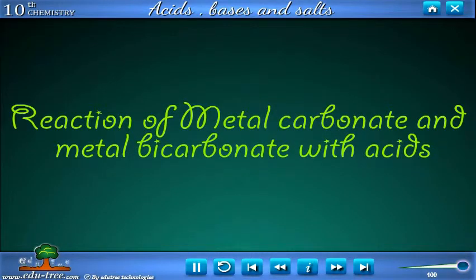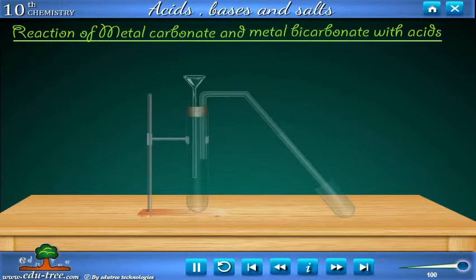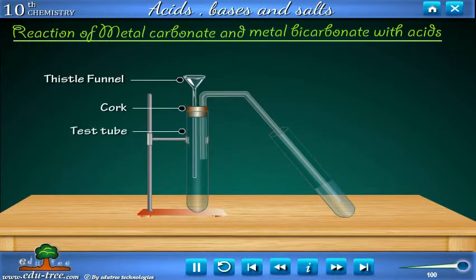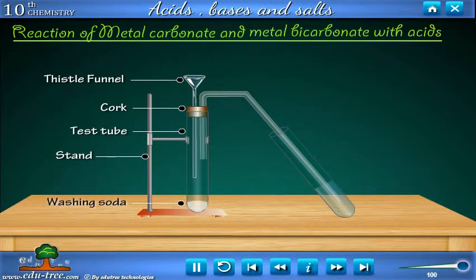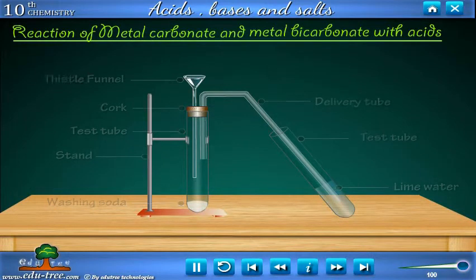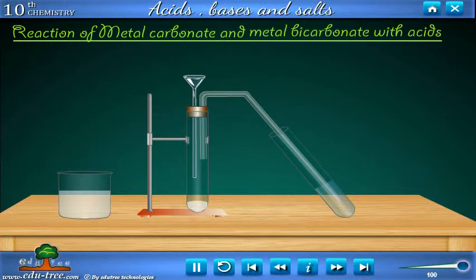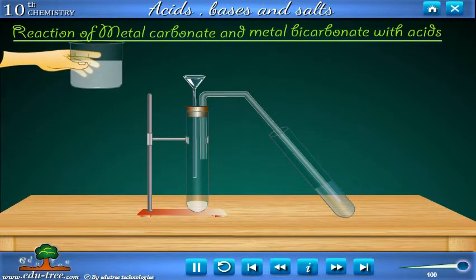Reaction of metal carbonate and metal bicarbonate with acid. Set up an arrangement like this. Take a small amount of washing soda in a test tube. Now add some dilute hydrochloric acid to the test tube.